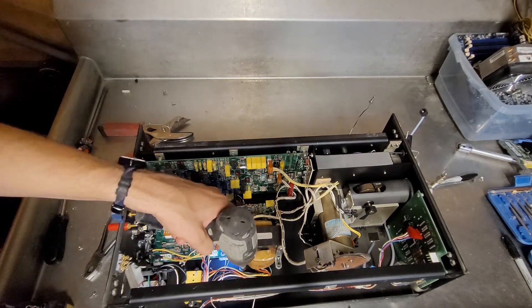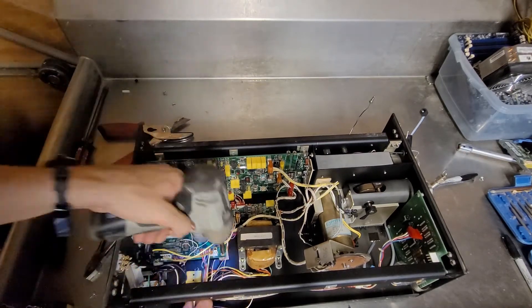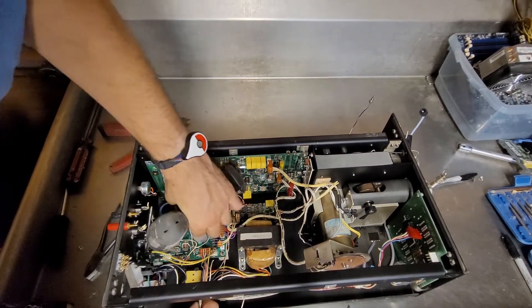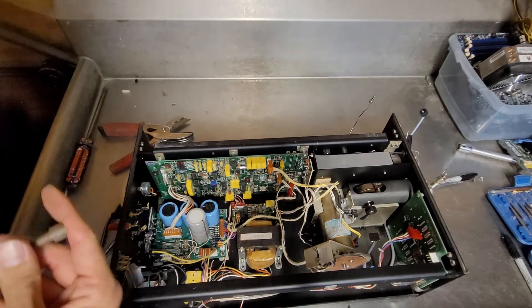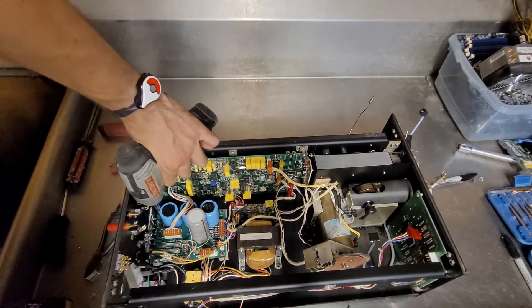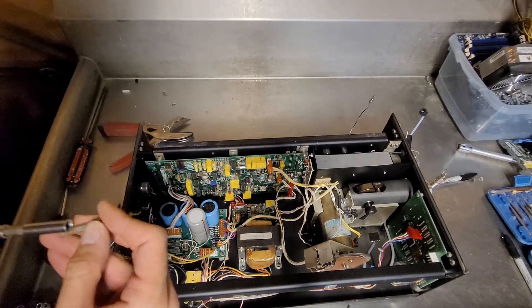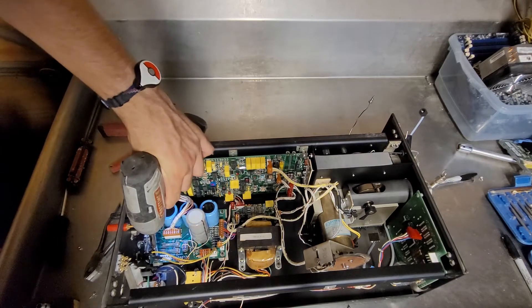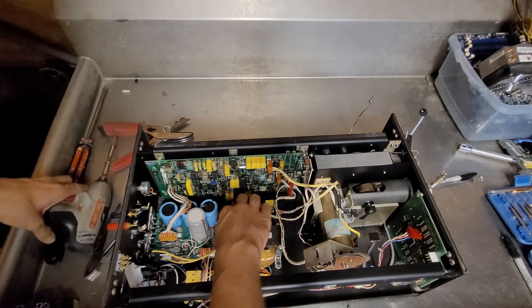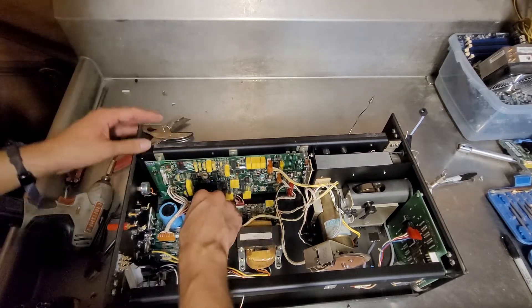What else can we hit? That might be a quarter inch. All right, that's not going to reach. It's going to be a pain.